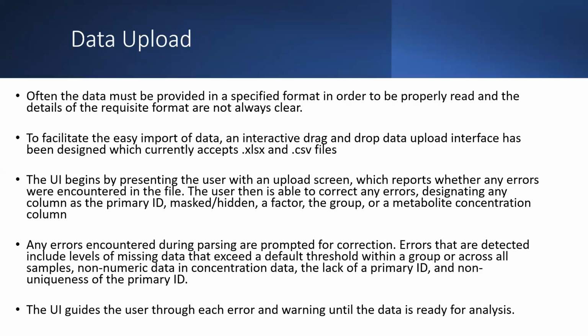So to upload your data, one of the things we may find difficult to do is getting our data in one of these formats. But if you have your data in Excel or CSV, you can actually upload your data on the VIIME platform. And the user interface starts by presenting you with an upload screen, which reports whether you have errors or if there's something you need to do in order to analyze your data before you can start with the data analysis.